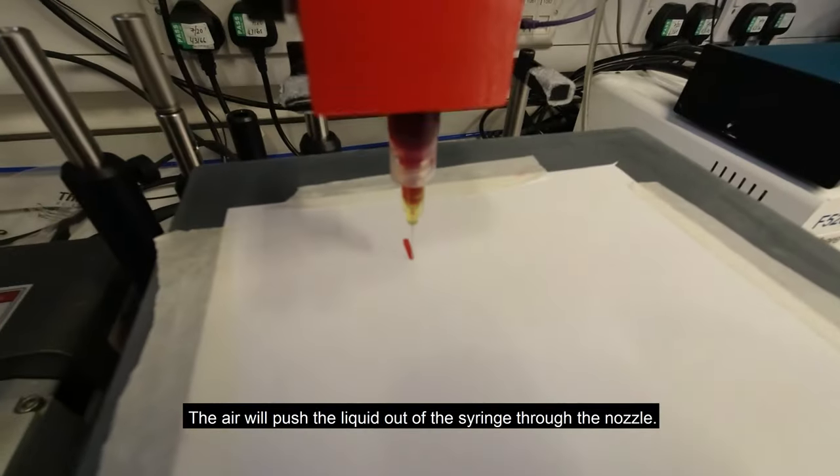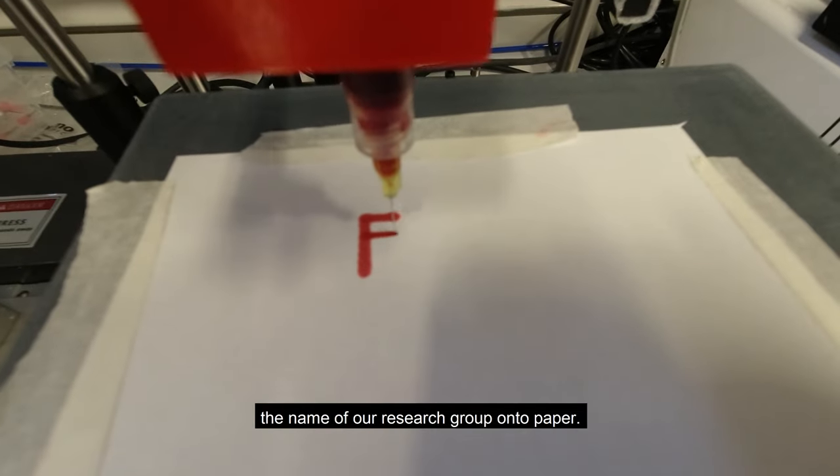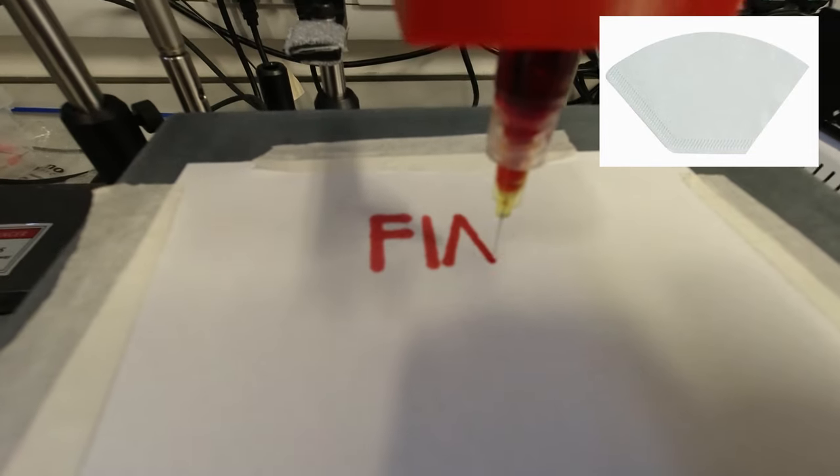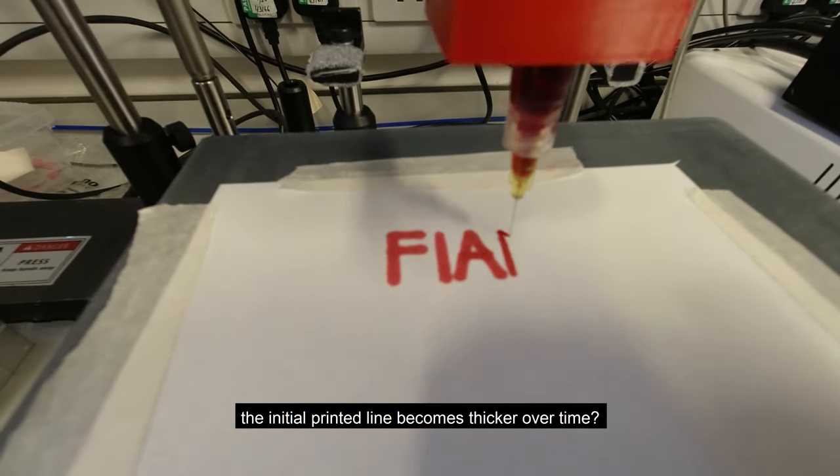We put back the lid that's connected to the air. The air will push the liquid out of the syringe through the nozzle. We've programmed the robot to draw the name of a research group onto paper. This is filter paper, similar to the coffee paper you have at home. Do you see that the red ink spreads on the paper and the initial printed line becomes thicker over time?